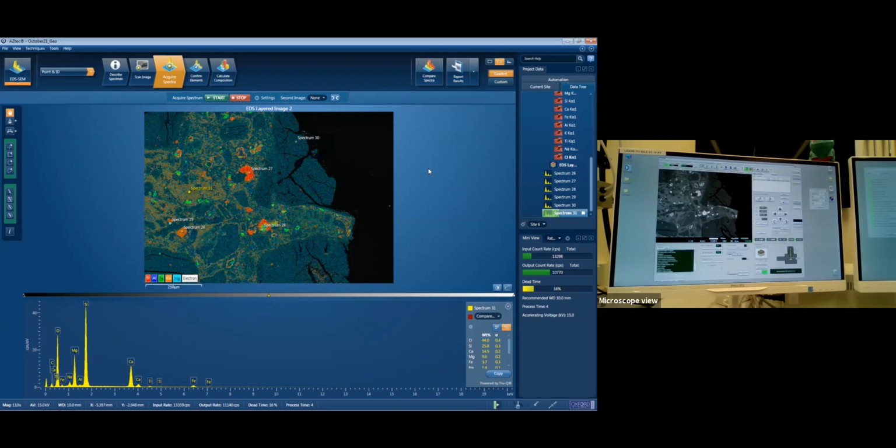So silica, calcium, magnesium, iron. That's this lighter stuff through here. So let's check the silica to oxygen ratio. 3. That could be pyroxene of some sort. Pretty high calcium. Probably lots of different things, I would imagine.